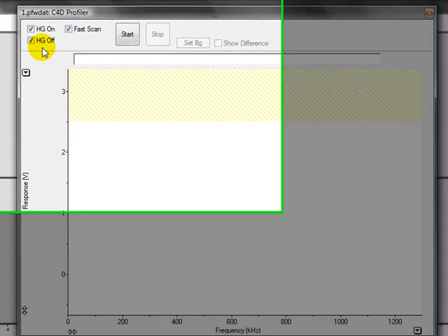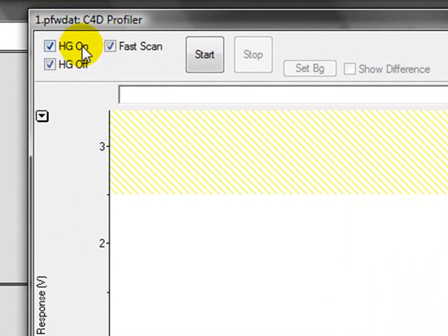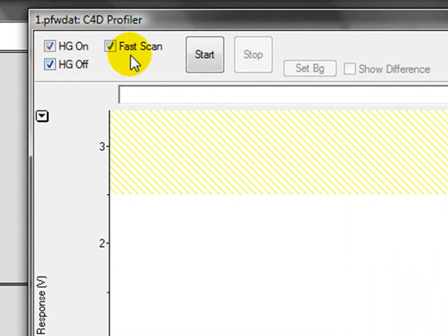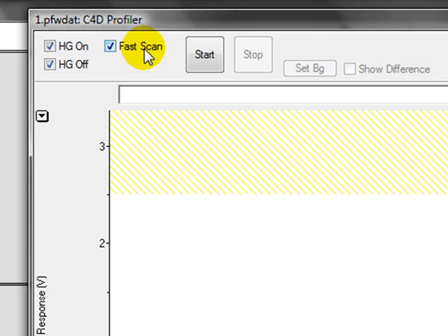You have various options. You can run with the head stage gain on, the head stage gain off, or do both. FastScan does every other frequency and amplitude, meaning it is 4 times as fast.